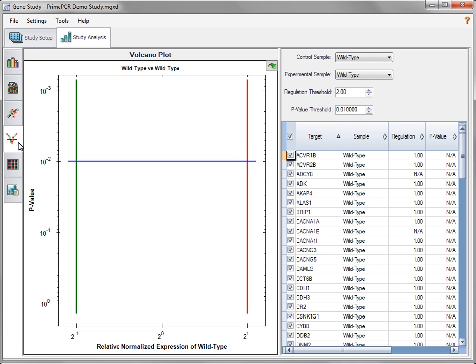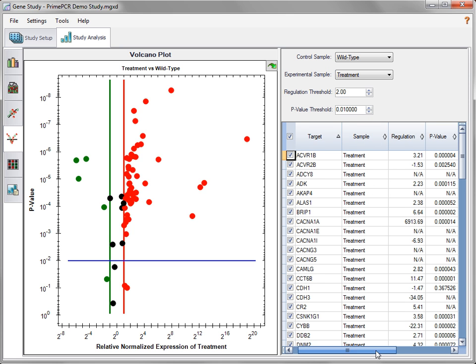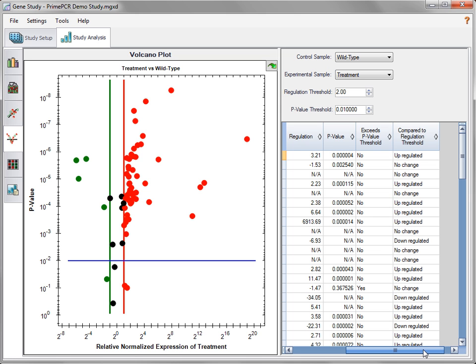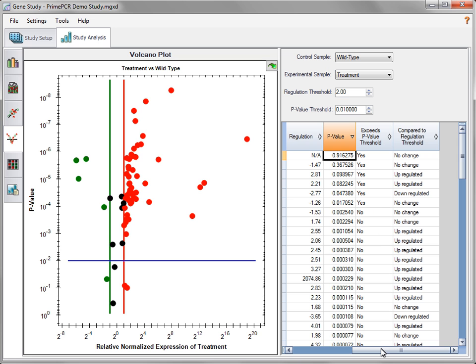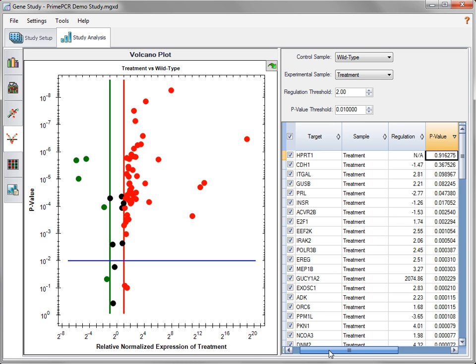The volcano plot depicts the relative normalized expression of an experimental versus control sample and indicates statistical significance. Use the drop-down menus to select the appropriate samples for analysis. As in the scatter plot, upregulation is indicated by red, downregulation by green, and no regulation by black. Statistical significance is determined by the p-value, which is the probability of an observed result happening if no real correlation exists. This value is calculated for all control and experimental samples that contain at least two replicates for each target.